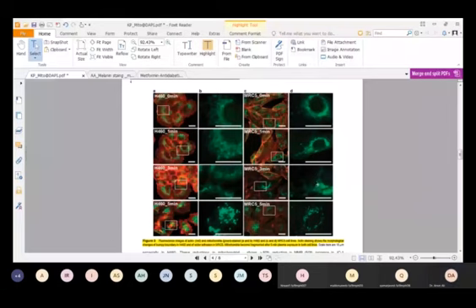Here in the 3-minute sample it is also similar, but here you can see the mitochondria are very small in size. They are not swollen like this sample. They are in very small fragments, not swollen at all. And they look quite different from this control sample. So from this data, you can conclude that using the staining technique, we can track the mitochondrial morphological changes. So this is the staining data, and you need to understand how we arrange this, how we present this, how we add this in a publication like this one.